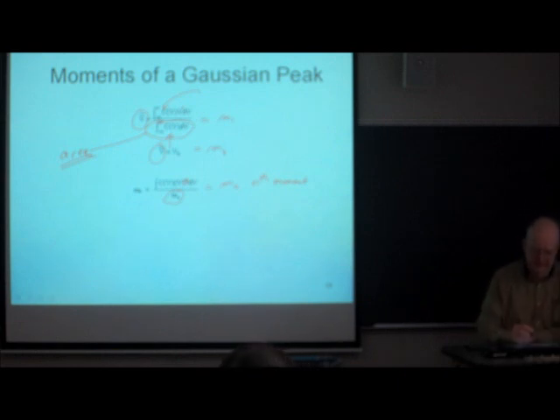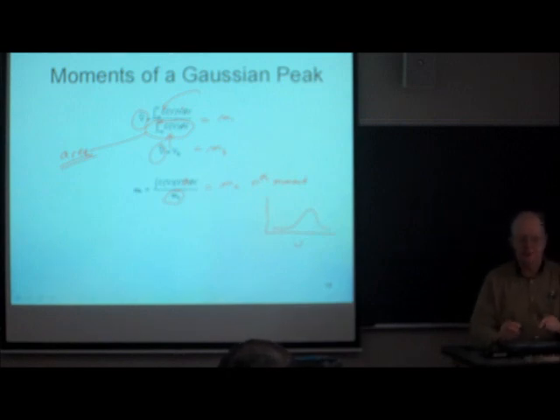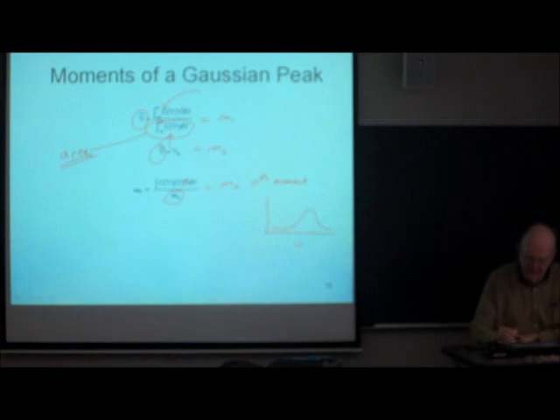Now, by the way, let me do a little sketch here. So here's volume. And there's my peak. When I compute a moment this way, multiplying by V to the n, I'm really computing the moments of the peak about the 0 point of the horizontal axis, whether it's volume or time, doesn't matter. I'm computing the moment of this about that.